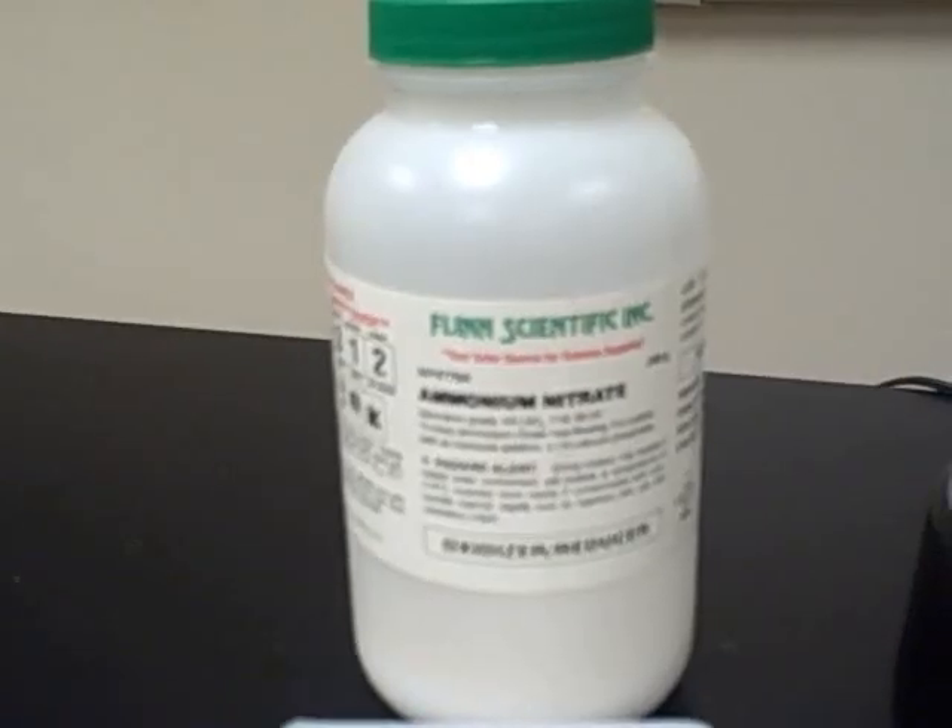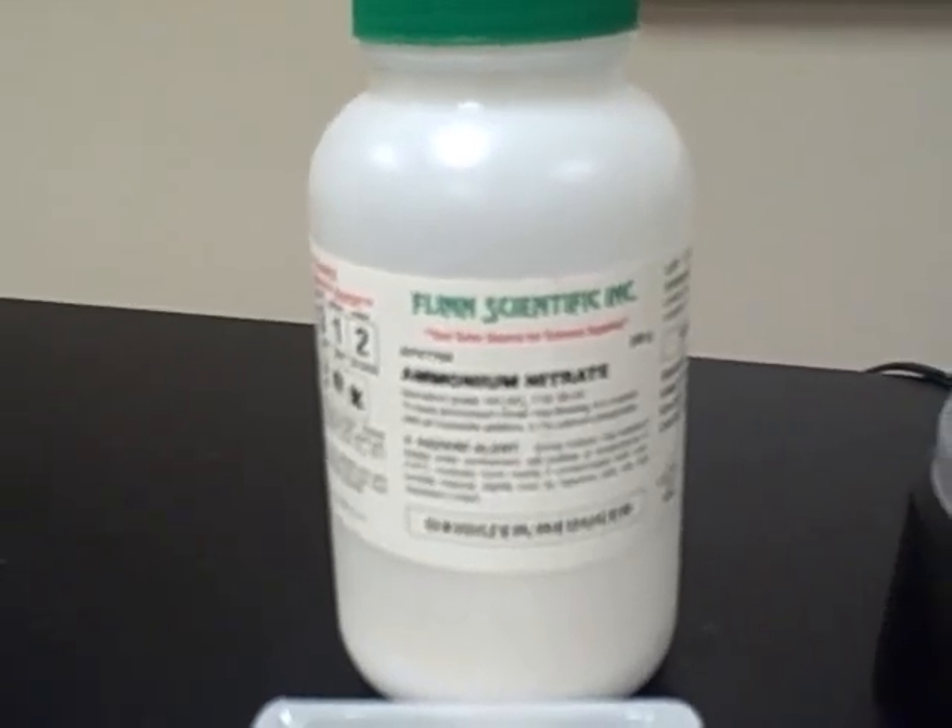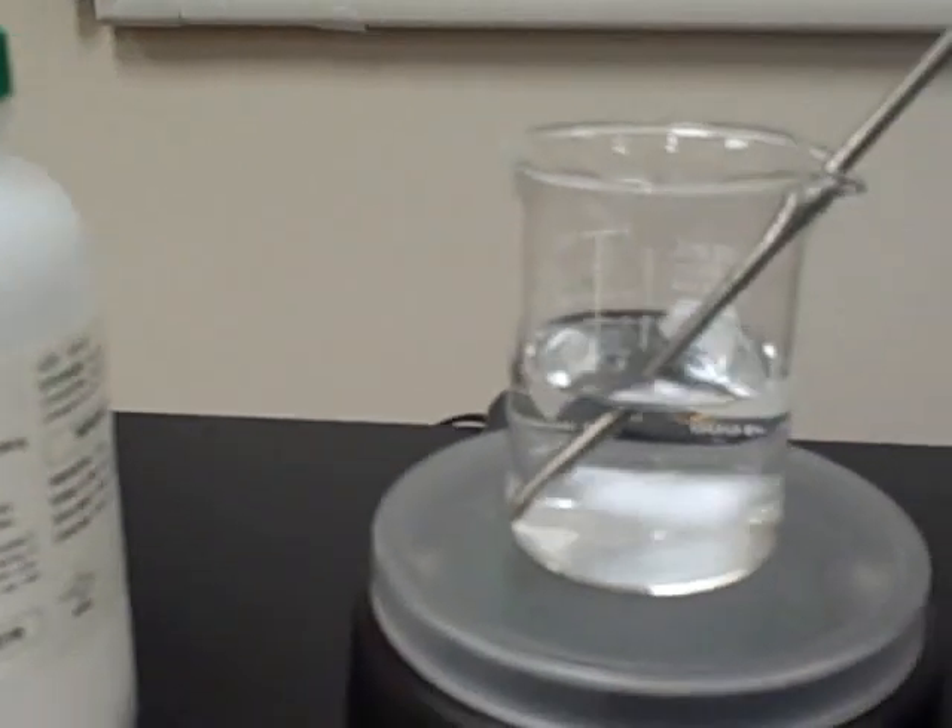In this demonstration, we're going to take solid ammonium nitrate and dissolve it into about 50 milliliters of distilled water, which has an initial temperature of 24.2 degrees Celsius.